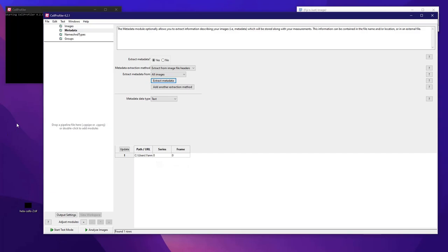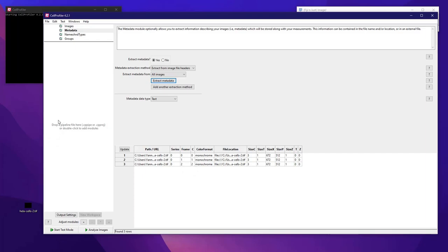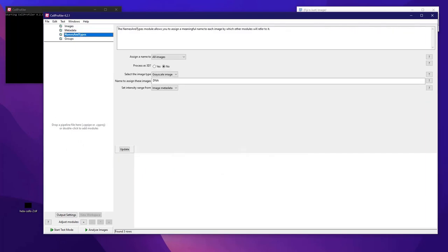If I press 'Update', I should now have information coming out of the header of the file. You can see it has detected that we have three channels, and the size of the image is here. The dimension X and Y are shown. What's interesting for us is the 'C' parameter, which will be used to create the channel in the next step. So let's go to the next step: Names and Types.